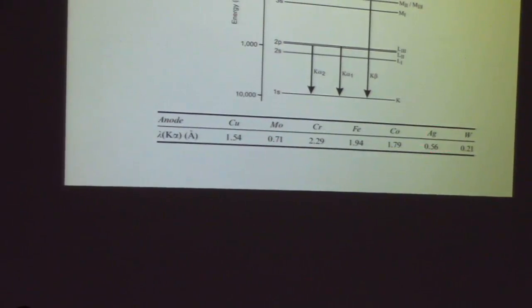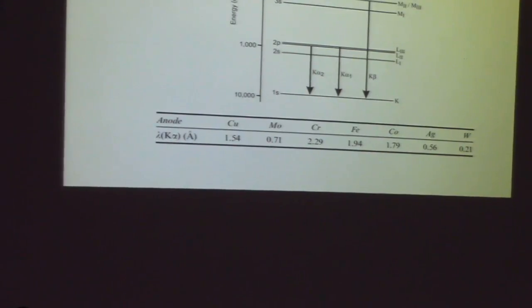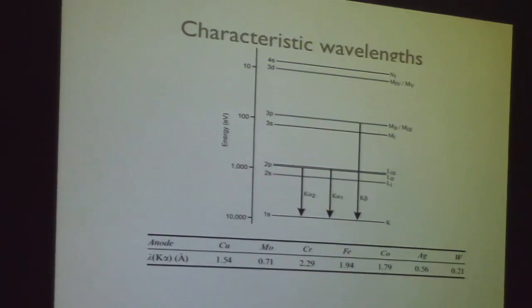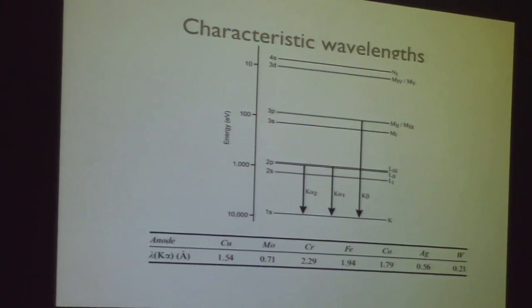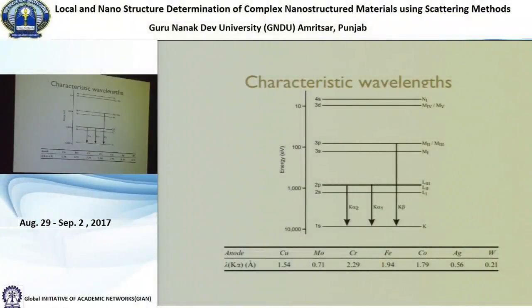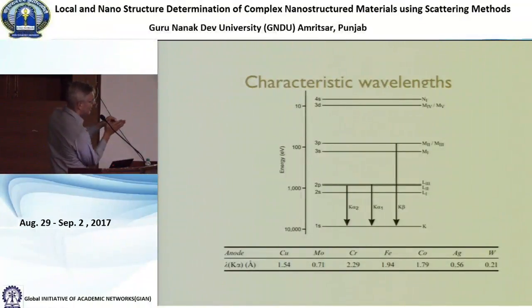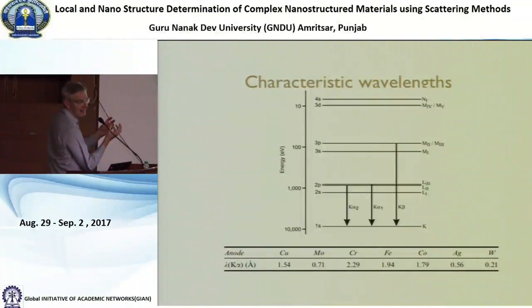The other problem with silver is, because it's operating closer to its melting point, it actually undergoes degradation. So the electrons actually start to sputter the silver, and firstly the silver target gets thinner and thinner and fails more quickly, so your silver tubes fail more quickly. And secondly, the surface of the silver starts to become, instead of being beautifully flat, kind of spongy-like. And then the X-rays can't get out: you excite an X-ray and you want to take it off at a glancing angle, but it gets absorbed again by the silver target itself.